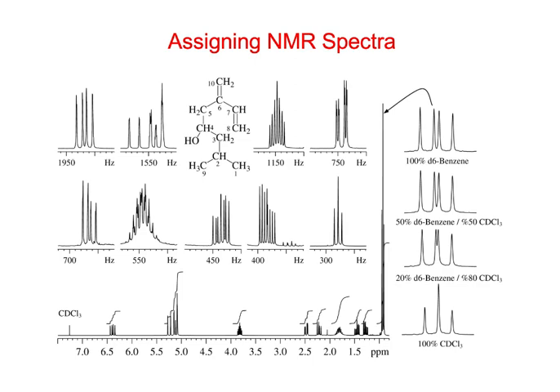So here's some peaks that are pretty complicated looking. You can see the splittings very well. You notice that some of them are sloping a little bit to one side or another. That kind of means that they're a little bit second order. And we can talk about that as we go through them.